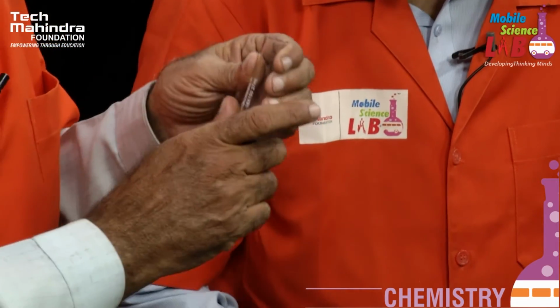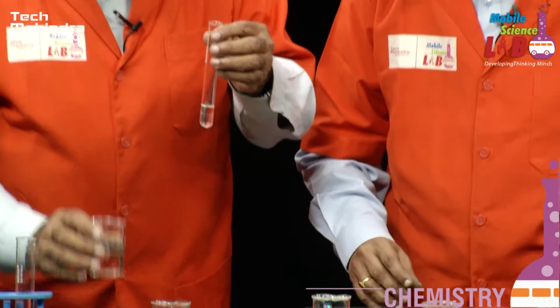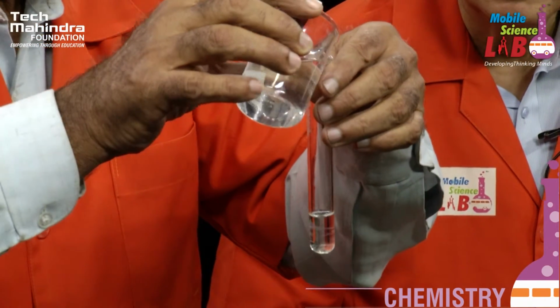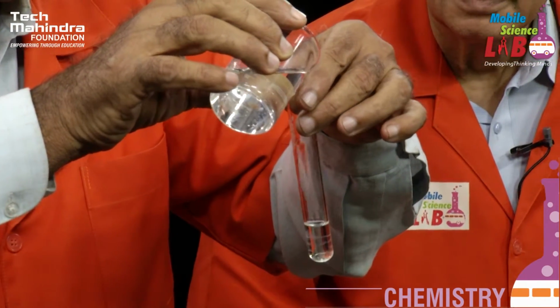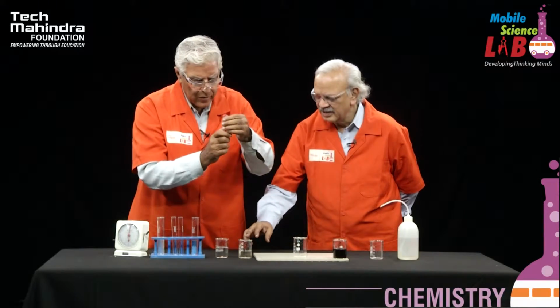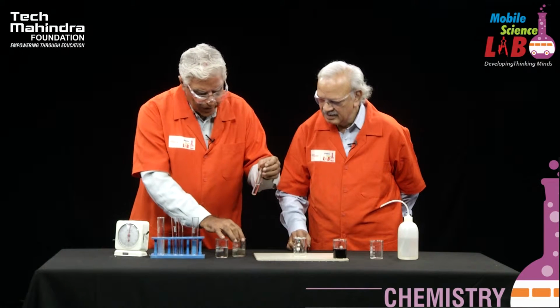I expect there will be an immediate color change, slowly, and then it becomes more and more intense. Clear, sir? See, these two are initially colorless almost. Now what's happening? Now we will see what happens over here.